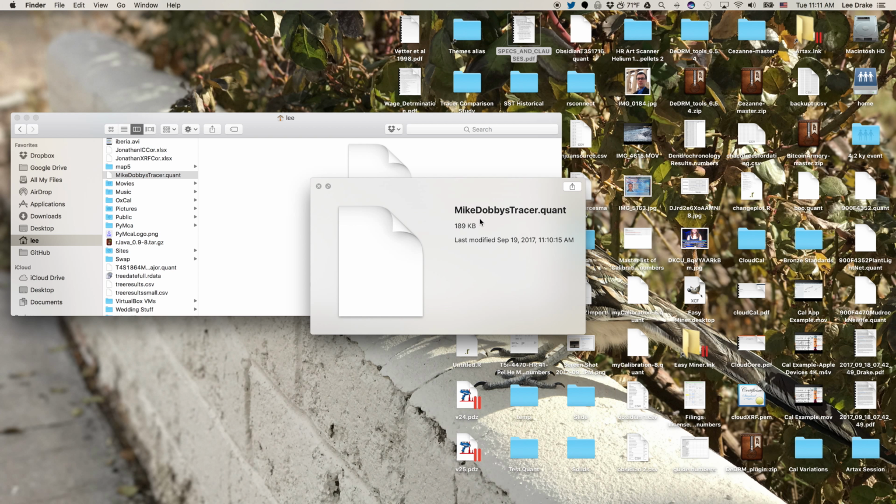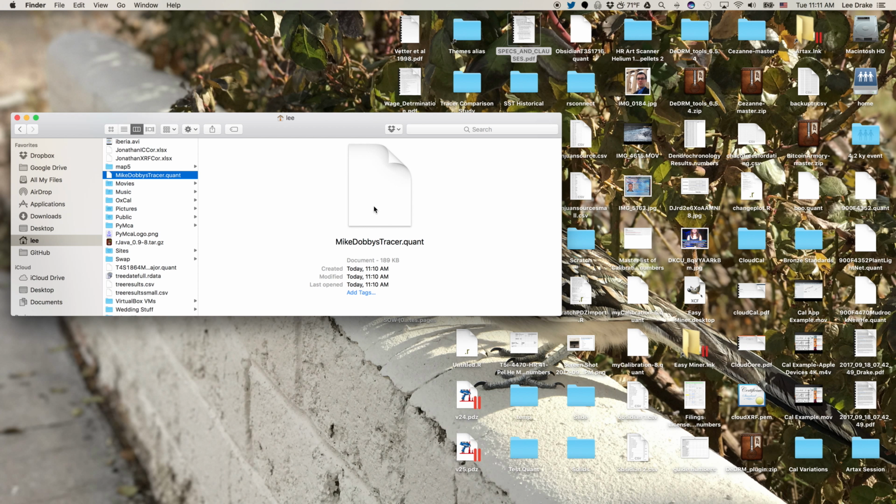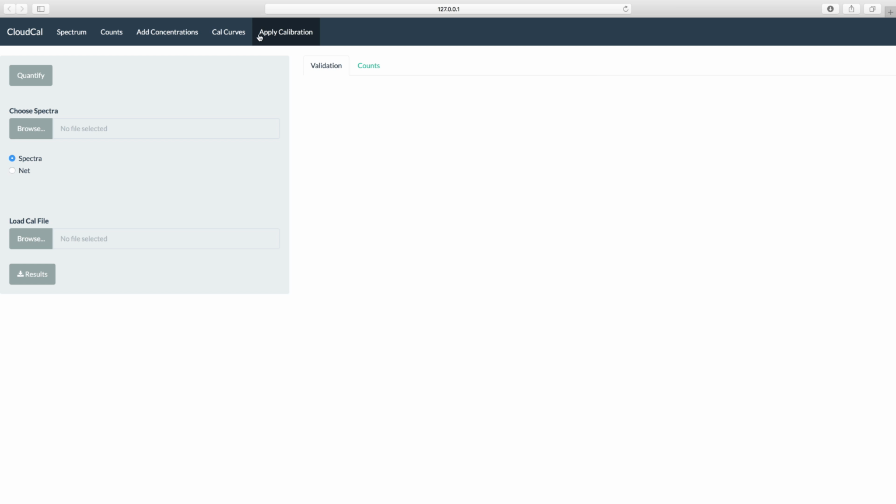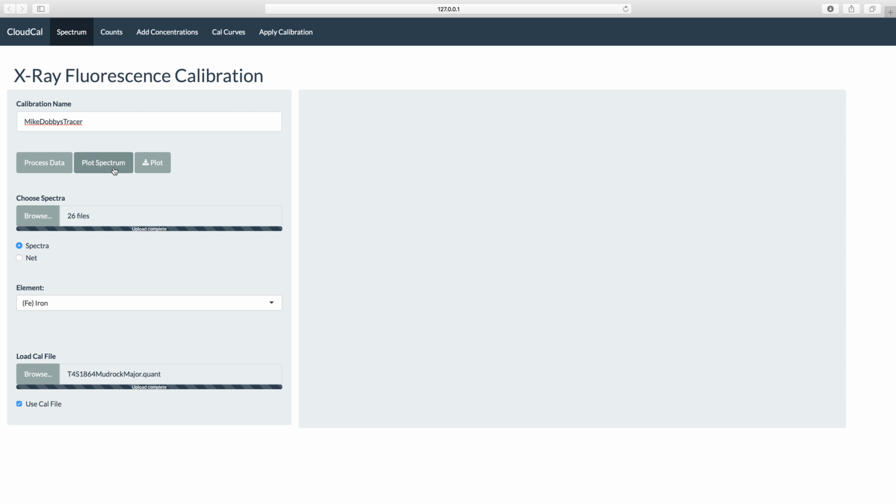We'll also have an obsidian sourcing app, which can then be generalized to ceramic sourcing. In general, though, you can basically build and custom design your own calibration files. The most immediate benefit of this is you now have an ability to do empirical calibrations on a unit using an open source platform.